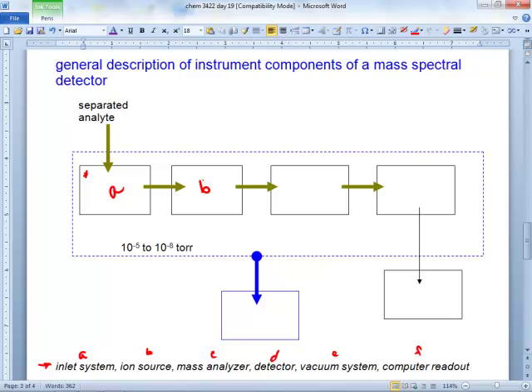No, because you're going to have all these metal rods in here, and they call them ion lenses. They only work on charged particles. You're controlling the magnetic and electric fields all in this meter-long area. So if it's not charged, it can't interact. So what is this? The vacuum system. It'll just suck everything out of there.